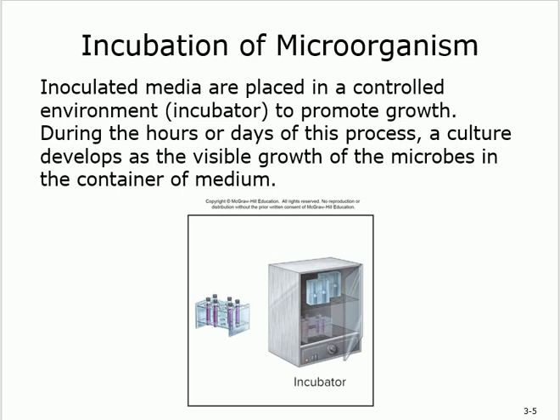So I put it in a tube. You can use a tube, you can use a plate, you can use a flask, whatever it is. If you've got a test tube, and you put the sample with the nutrients, you put it in an incubator, and you know that for this organism to grow, I need the temperature to be 60 or 70 or whatever it is. And I know these are the nutrients needed for this organism.